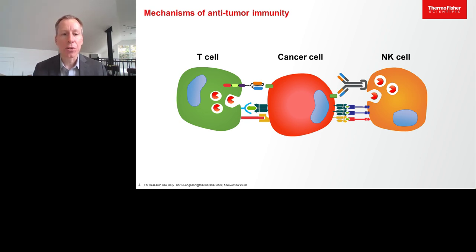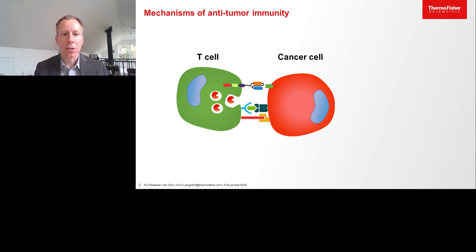And so we'll go over a range of different protocols for not only isolating these different cell types, expanding their number in culture so you have more to work with, and then matching up these immune cells against various cancers and show how we can study their behavior and how we can modify that behavior using different therapeutics. So let's start off by looking at T cells.